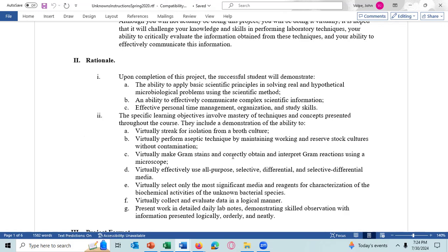You're going to pretend to do that in this online class. You're just going to pretend to do it. Okay? Yes. That's why I say virtually streak out for isolation from a broth culture.